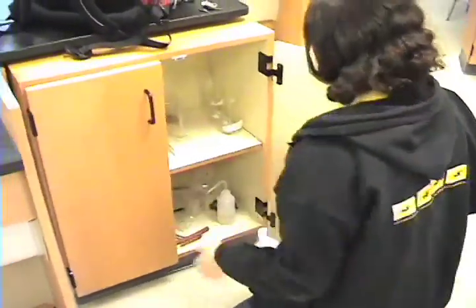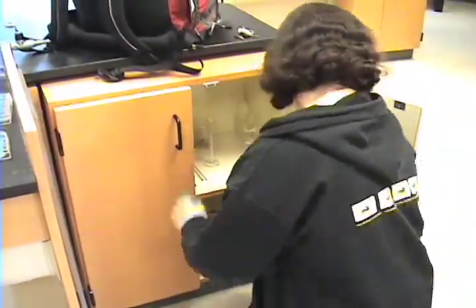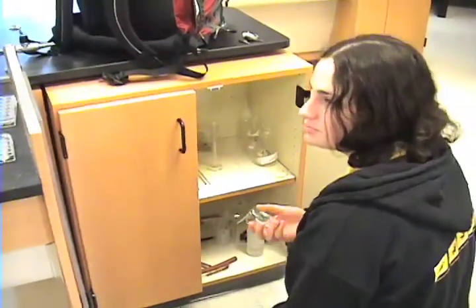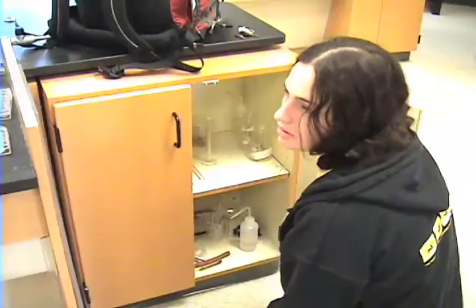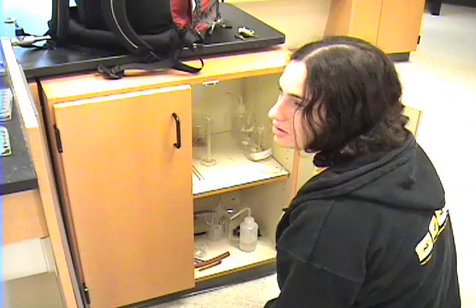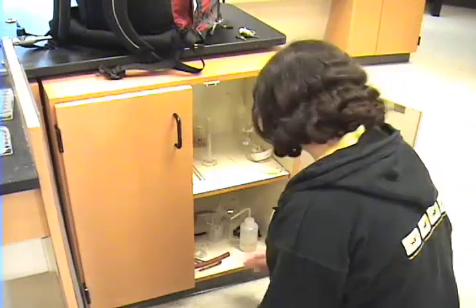A good chemist has an organized workstation. It is important to be familiar with the lab, having read it prior to coming to class. Know what equipment you need — for example, the 50 milliliter beaker.